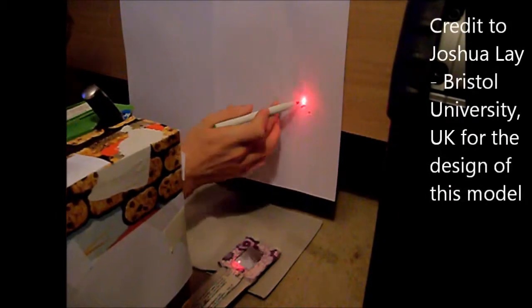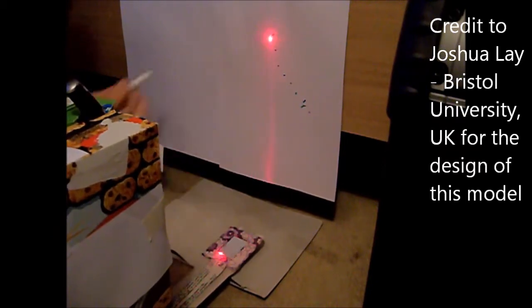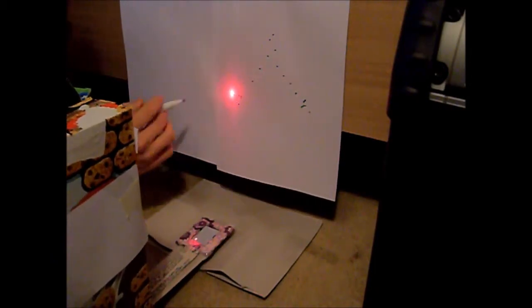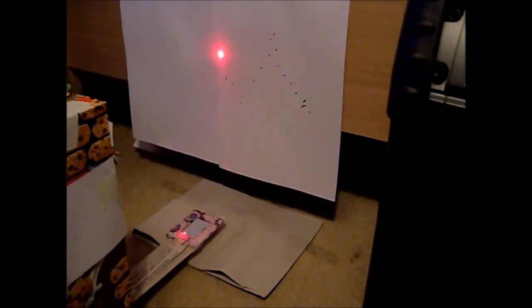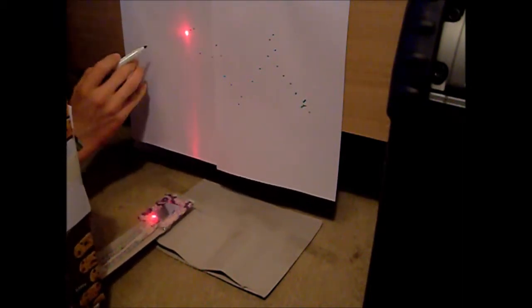As the AFM moves over the sample, the tip interacts with the surface as shown here. The laser reflects off and can be measured, in this case by plotting the path which the laser took. Mine is slightly less than accurate as this is quite a complex model to operate single-handedly. We can join the points up to create a magnified version of the surface scanned. The cantilever would then be moved forward slightly and the process repeated.